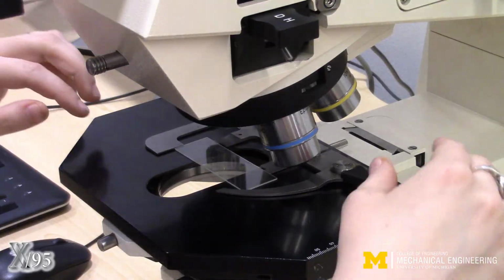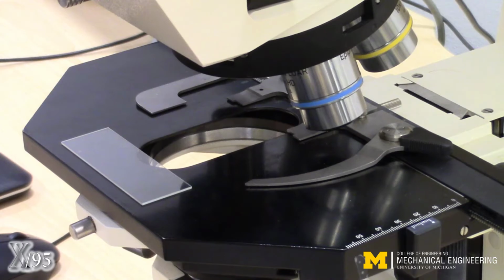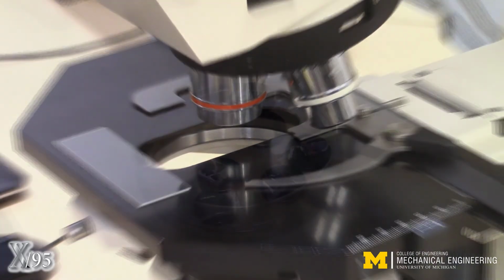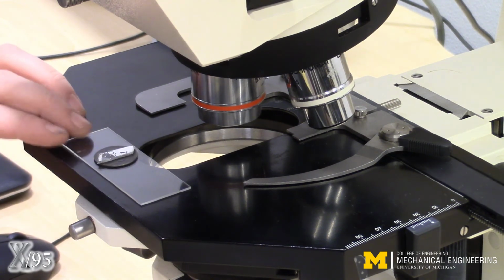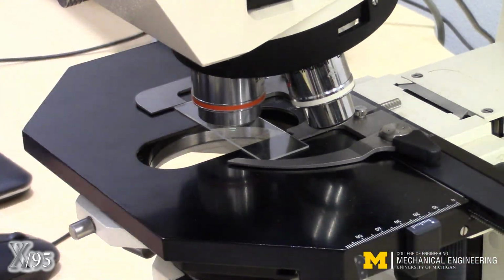Open the holder claw and gently remove the glass slide. Rotate the objective lens to a low magnification, such as 5x, marked with a red stripe. Use tweezers to select a specimen and place on the glass slide. Carefully seat the slide into position and close the holder claw.